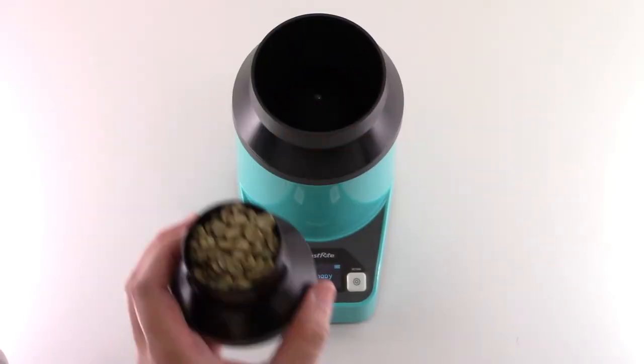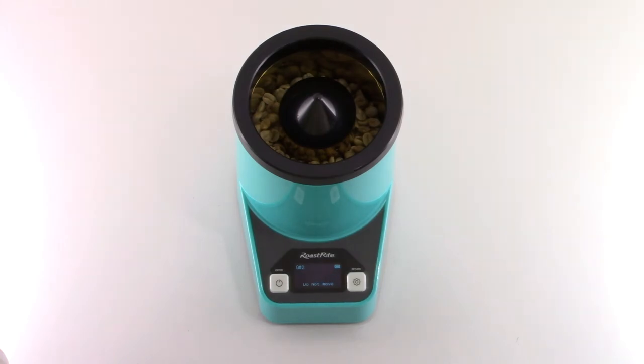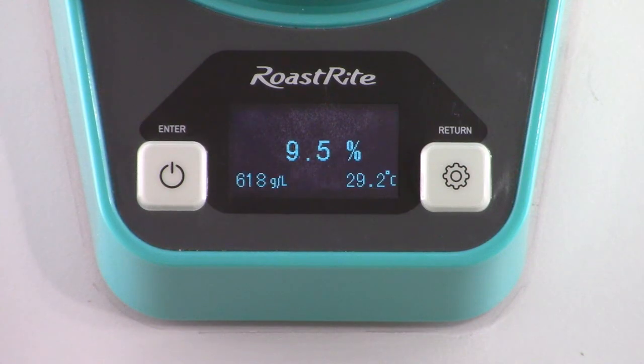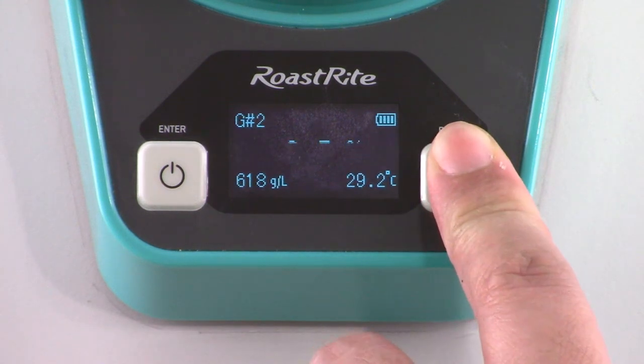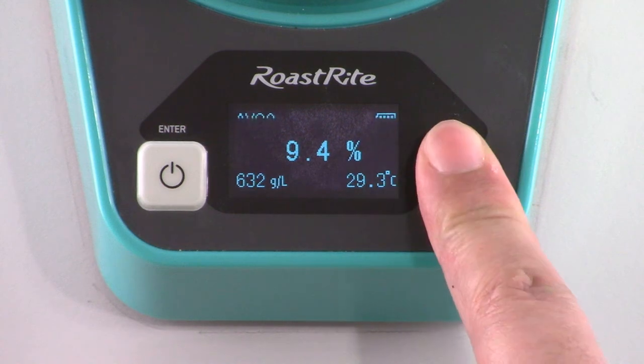Perform the same steps again. Once completed, the screen will show the results for the second measurement. Press the right button to show the average of all results. To go back to the main menu, press the right button again.